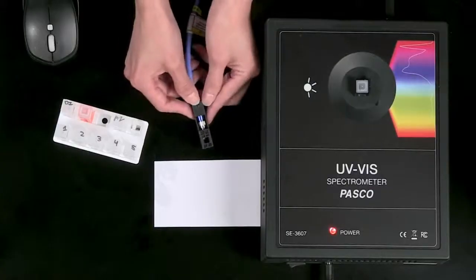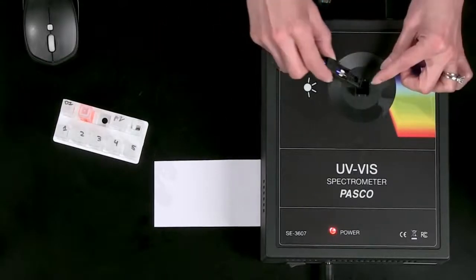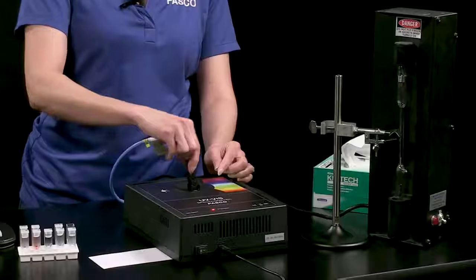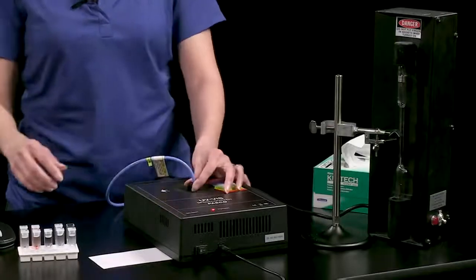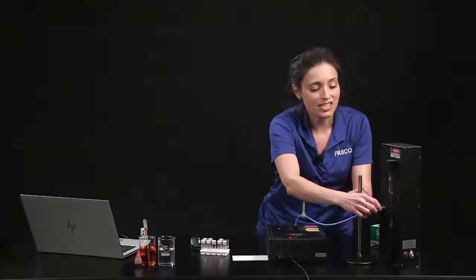To properly position the fiber optic cable, find the triangle on the cuvette housing and line it up with a notch on the cuvette holder on the spectrometer. Position the other end of the cable near your light source, but not touching.